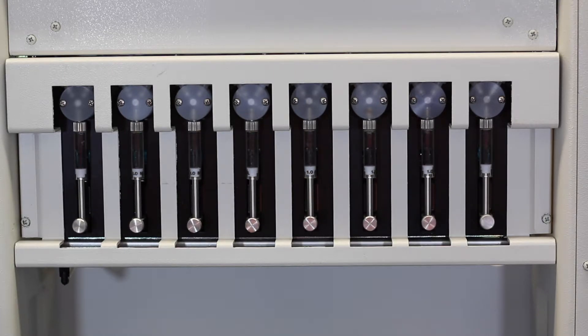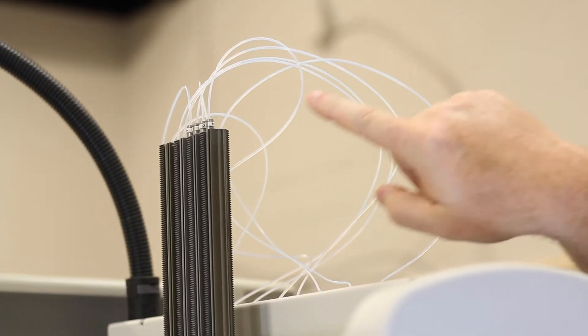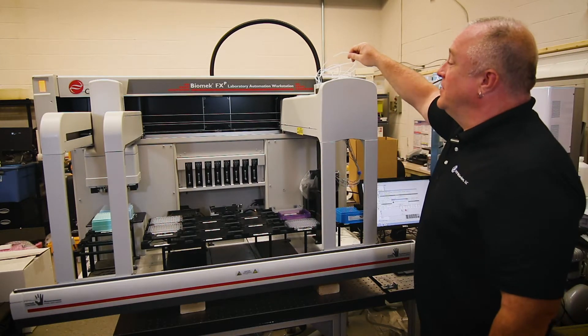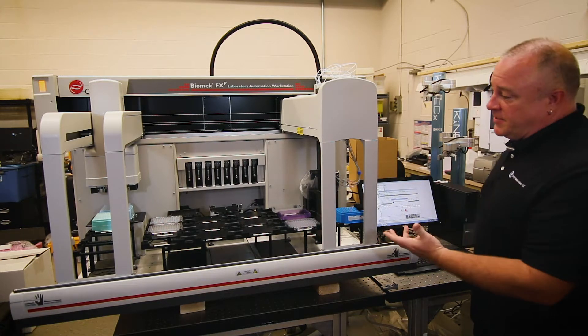Just let it run until you have no bubbles within the syringes. Once there are no bubbles there, go over to the syringe line and make sure there are no bubbles in there either. It usually takes about three or four strokes to get the bubbles out of the system. Let it run until you see there are no bubbles in the syringe lines. When there aren't, go ahead and click OK and it'll finish the procedure.